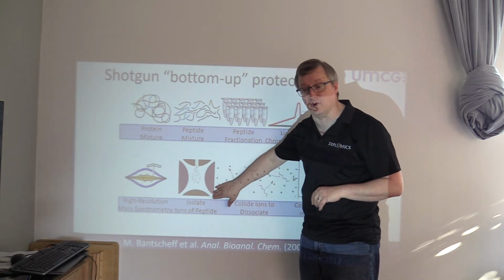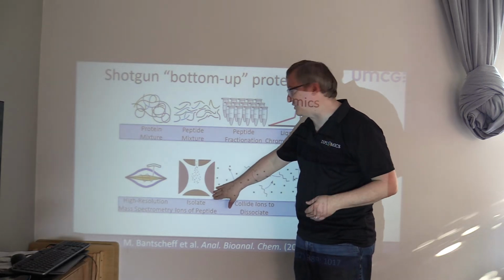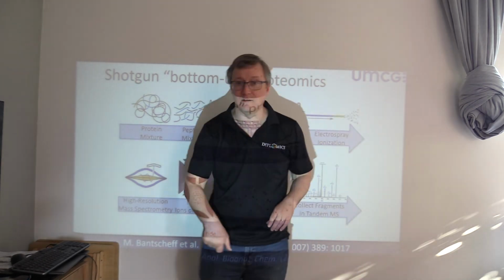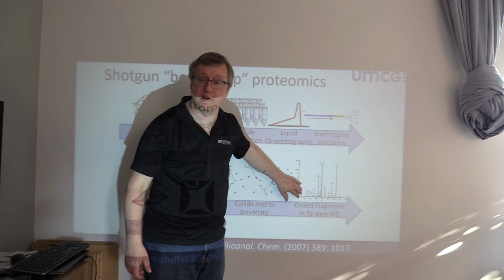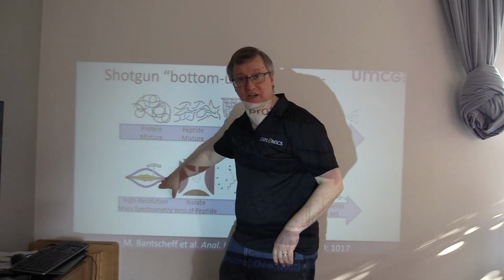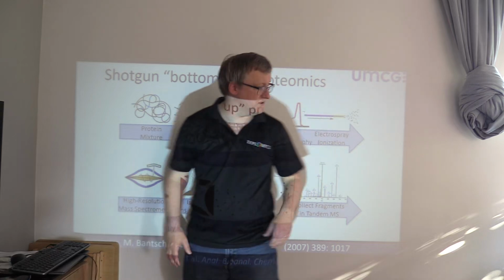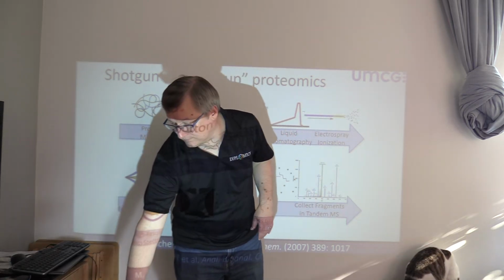We're going to isolate a whole bunch of ions of the same peptide, maybe 10,000 copies of a particular peptide. We collide those peptide ions with gas, and that collision process produces fragments. The fragment ions are measured in a tandem mass spectrum. So we have a mass spectrum saying what the intensity of the precursor was, what its mass was, and then we have a report of which fragments are generated from it.